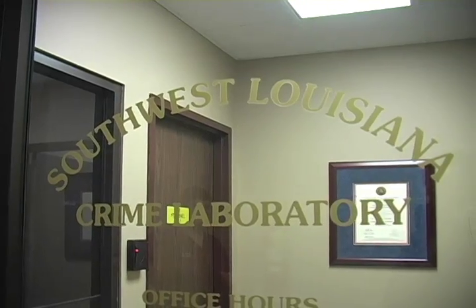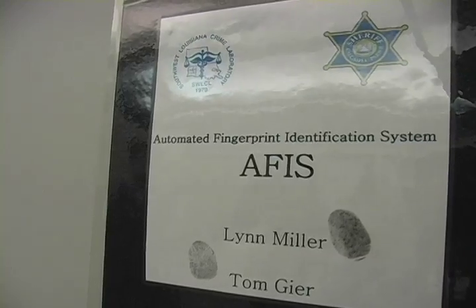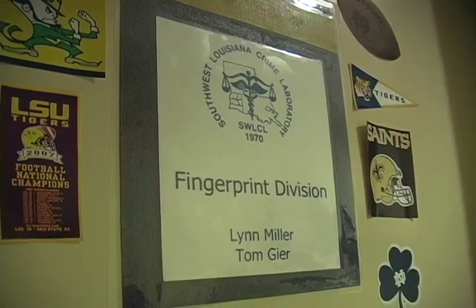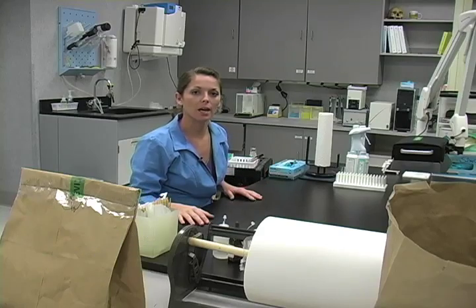At the Southwest Louisiana Crime Lab, analyzing DNA evidence takes a little longer than you might think. DNA analyst Rhalie Austin shows the first step, which is testing clothing and taking samples. I will be working an item of evidence from a made-up case.